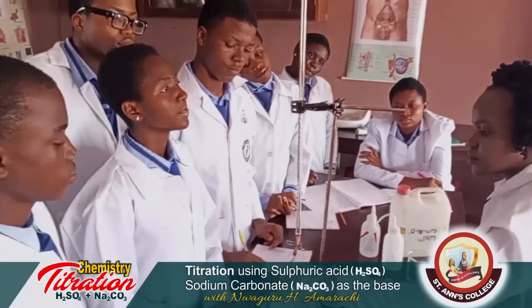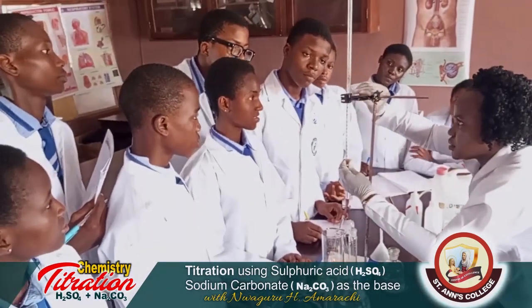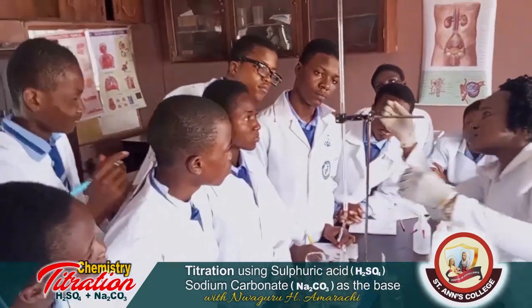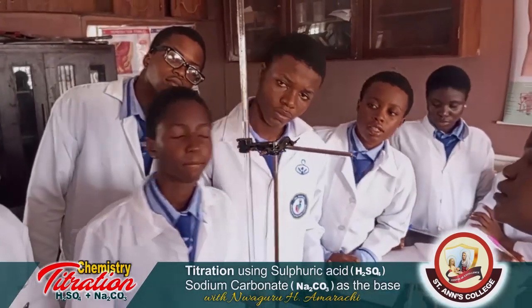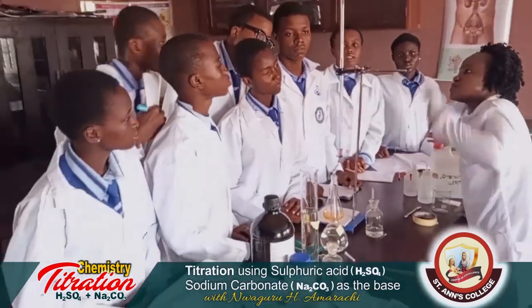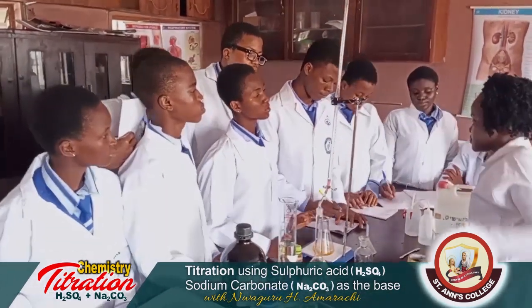So let's take our reading. Adjust the volume. 24.20.